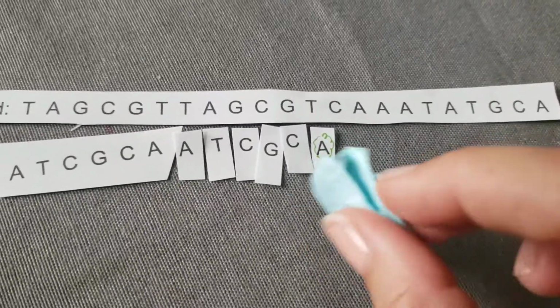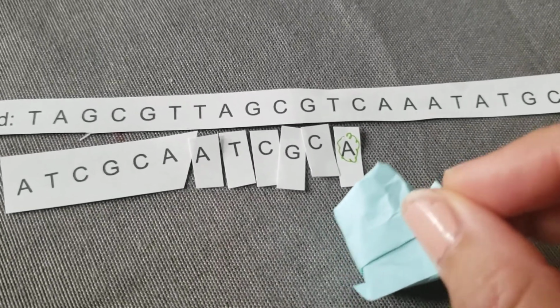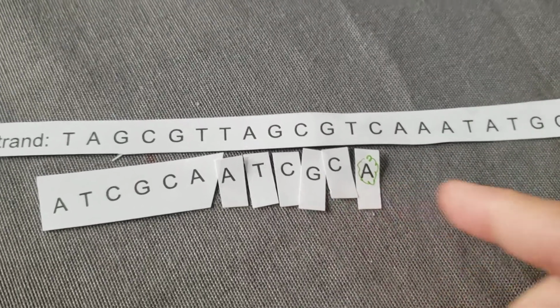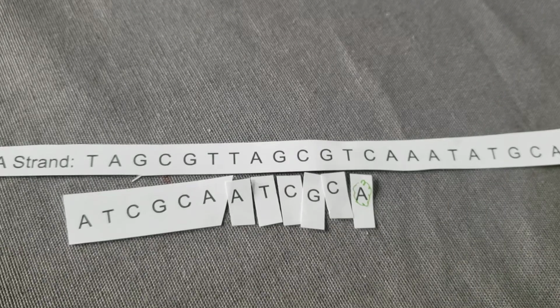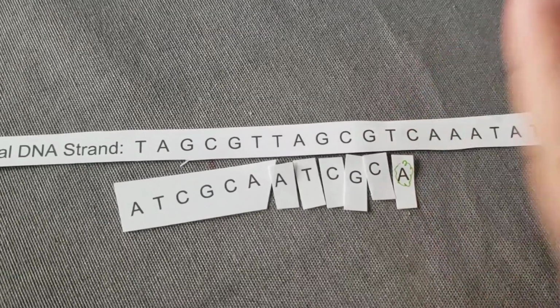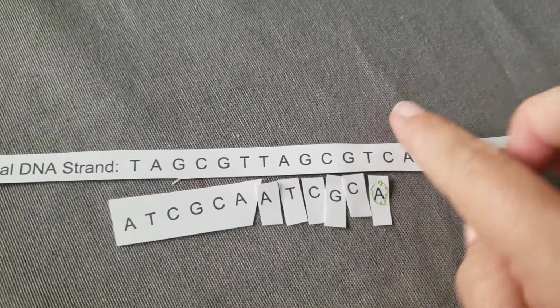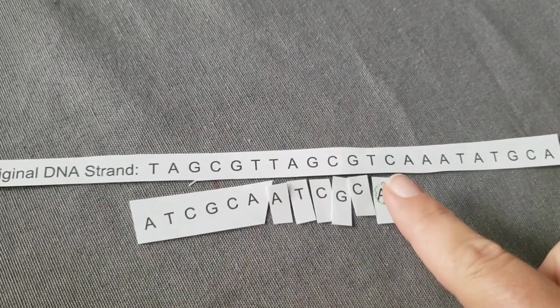I don't know exactly what happens there, but it's a conformational change with some sort of chemical interaction where the DNA polymerase can no longer build any remaining nucleotides onto our second strand of DNA. So essentially what's happened is our double-stranded DNA has been truncated at this point. The fact that there's excess DNA here is sort of irrelevant. All that matters is we have a double-stranded set of DNA right here, okay?